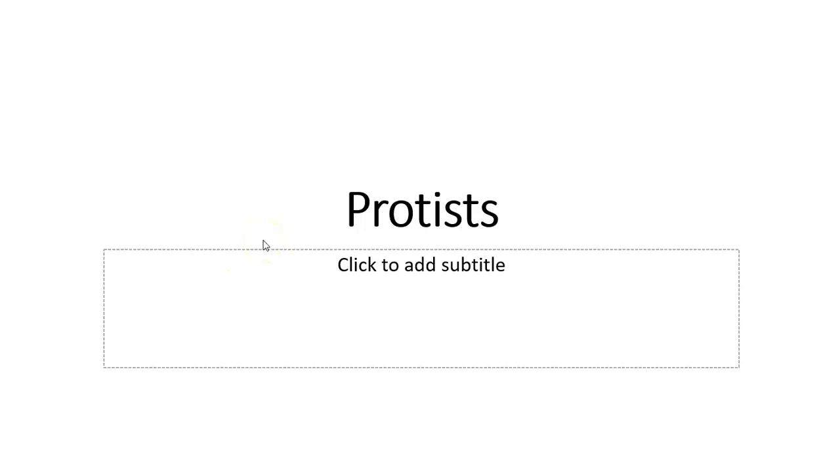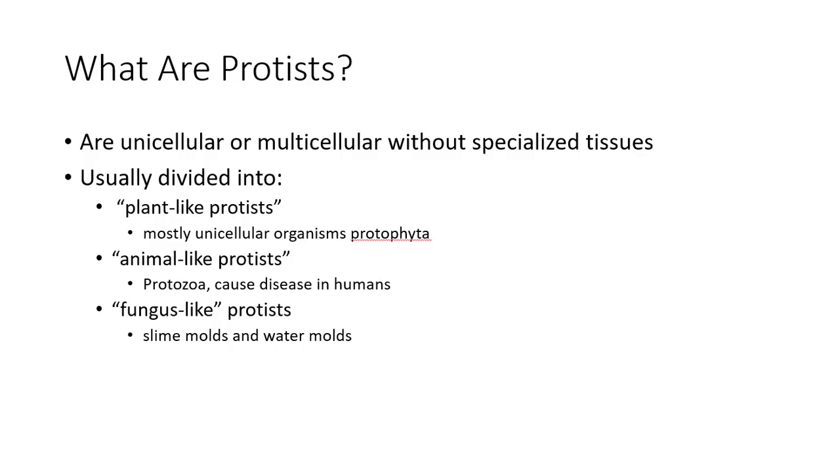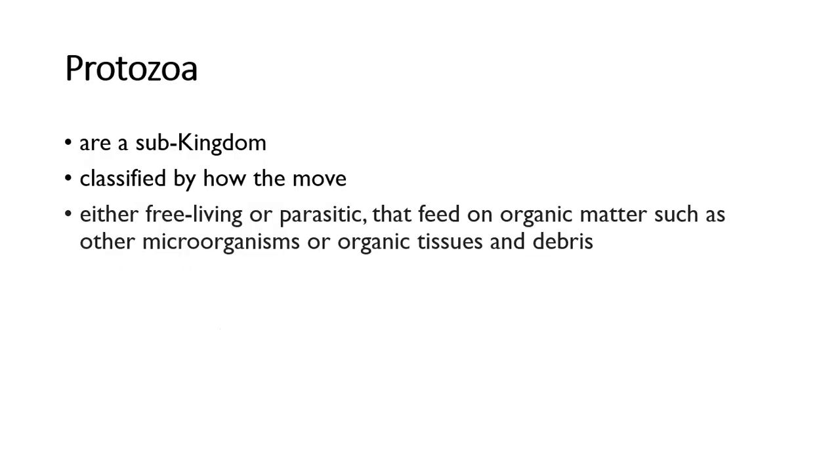Okay, in the lecture I gave you a basic go over the protists. In the lab, we need to recognize them as if we were in the lab. Again, we talked about plant-like protists, animal-like protists, fungus-like protists. But you're going to have to be able to recognize them, and I'll give you a list. There'll be basically the same pictures that we have on these lab slides, so you'll be okay.